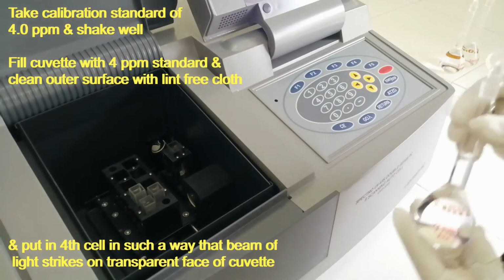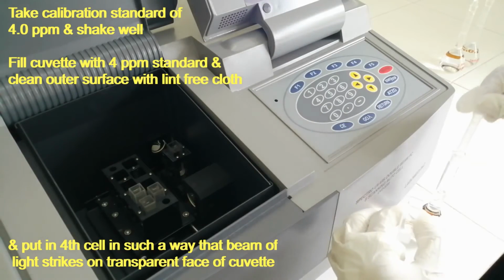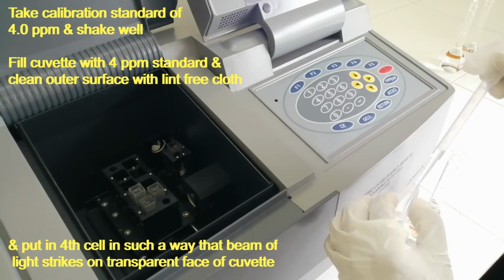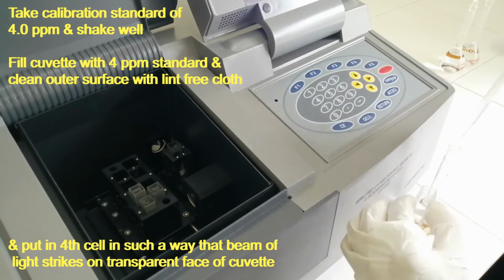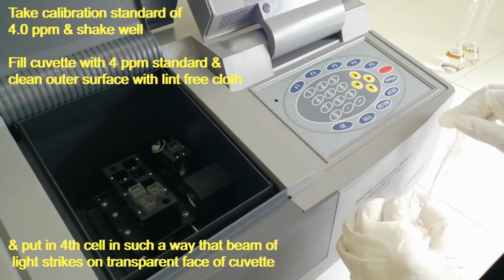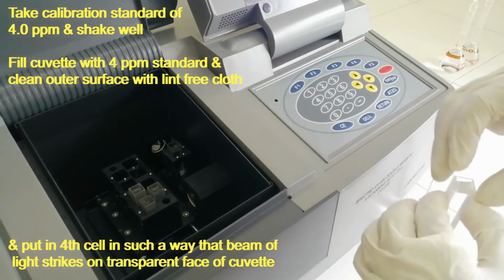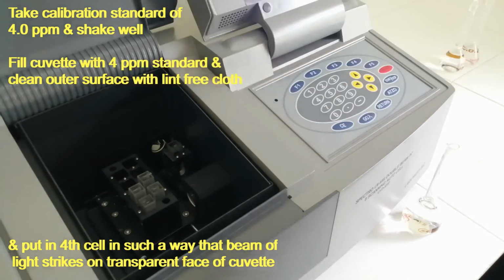Take calibration standard of 4.0 ppm and shake well. Fill cuvette with 4 ppm standard and clean the outer surface with lint-free cloth. And put in fourth cell in such a way that the beam of light strikes on the transparent face of the cuvette.